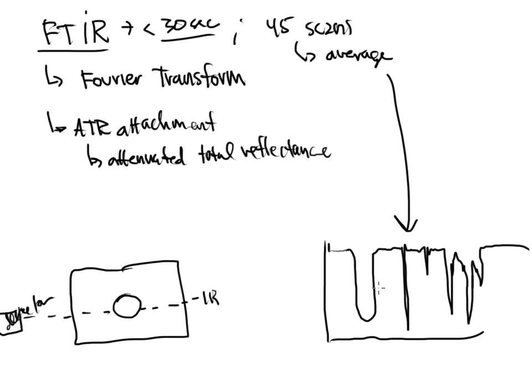All right, well, that's good news with FTIR. It makes my job much easier because it's quicker. I don't have to wait as long for it to do its thing. Not only that, but even if I am waiting just a little bit longer, it's no big deal because I'm getting 45 scans all at once.